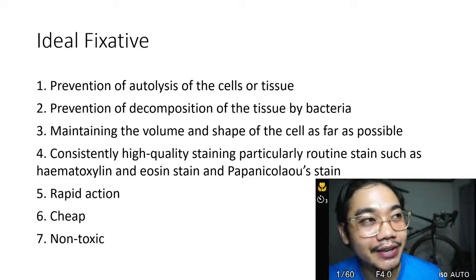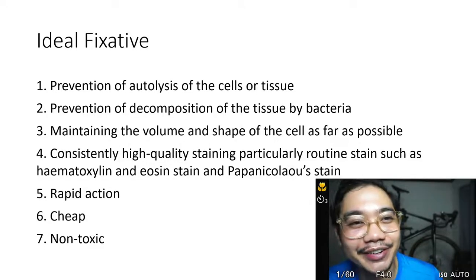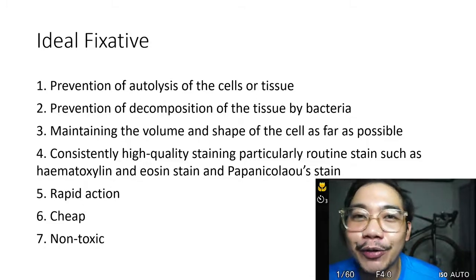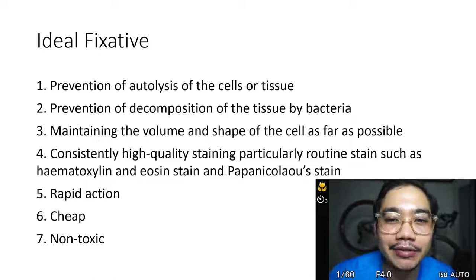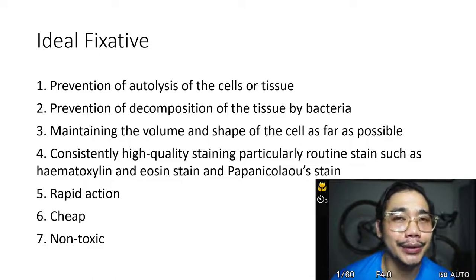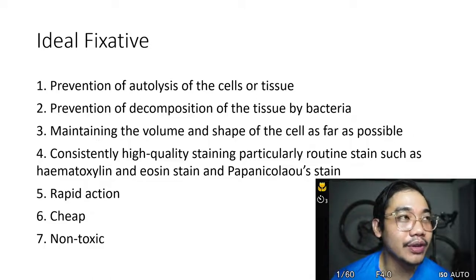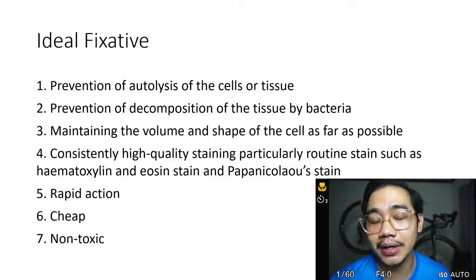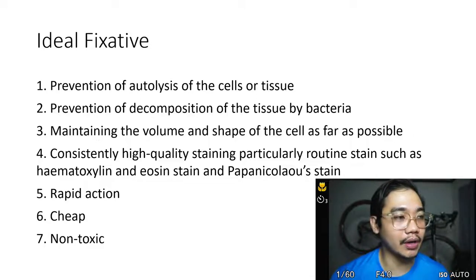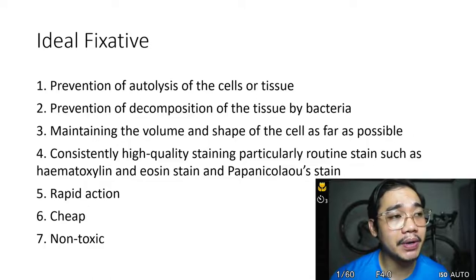But here in the Philippines, our priority is probably to kill any pathogens there, no? Because come to think of it, when you receive a tissue, a piece of your skin, your appendix or your gallbladder, it is full of blood. And the pathogens there are tired from whatever, no? So there are many bloodborne pathogens, and then of course the occurrences that we cannot avoid, where you get wounded, any punctures.